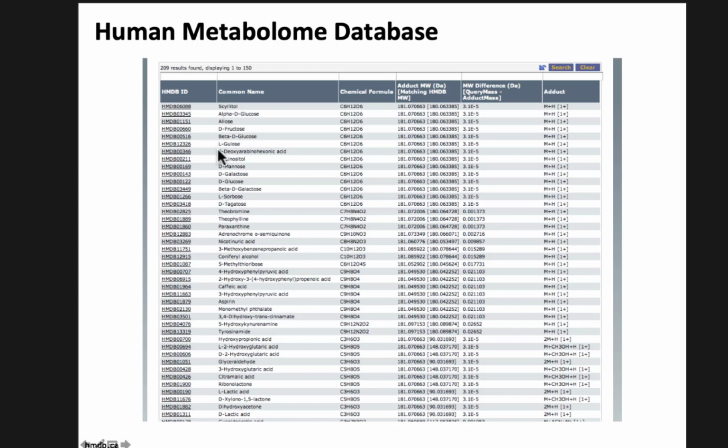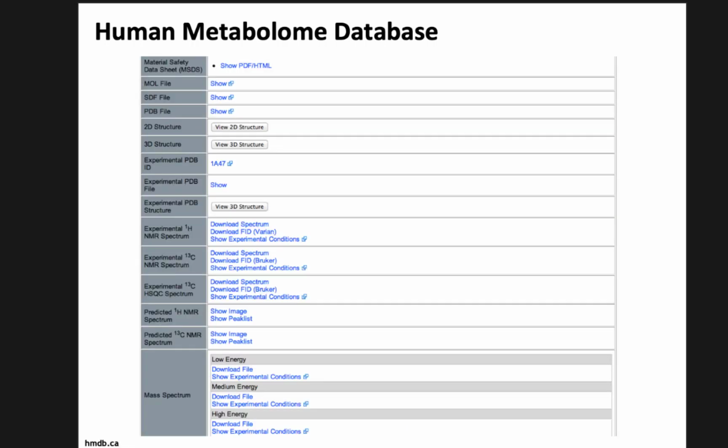Of course, glucose is within this list, but it's also a nasty example. Why is it a nasty example? Because all these hexoses are, of course, isobaric, and they're isomers. They're just stereoisomers. So you get a full enumeration of all the monohexoses here. At the same time, you see also other things like aspirin can pop up, not exactly the same mass, but these lists can get several hundreds of entries long, depending also on the mass accuracy that you use.